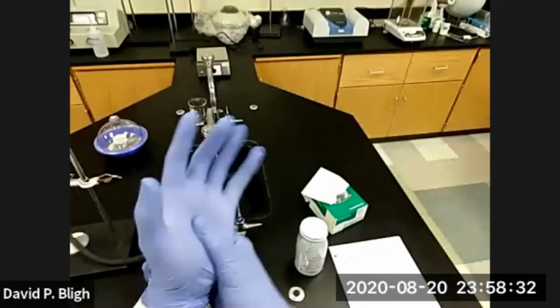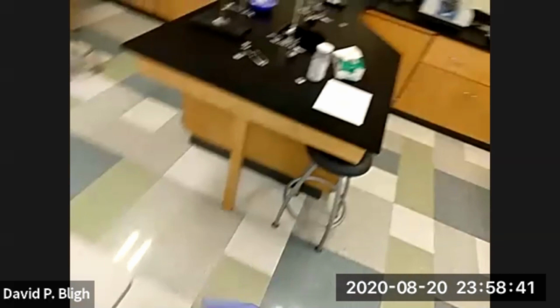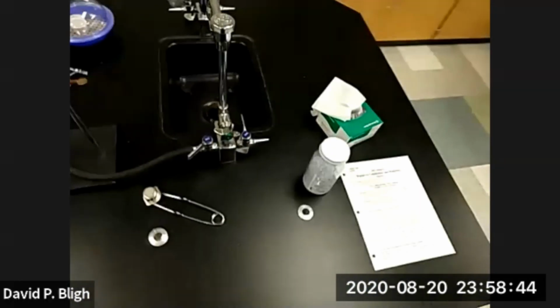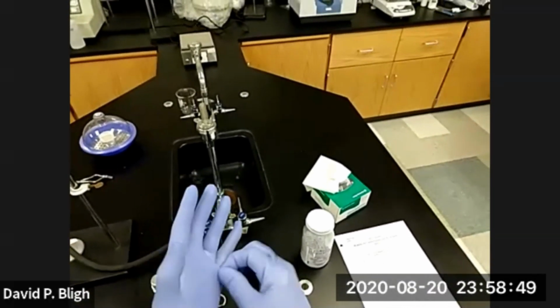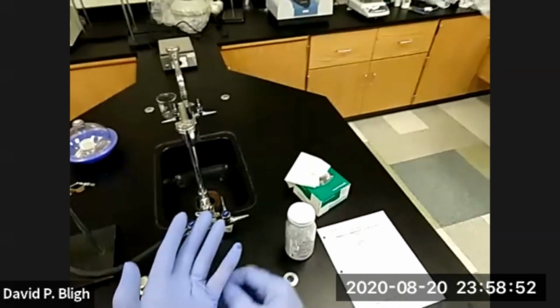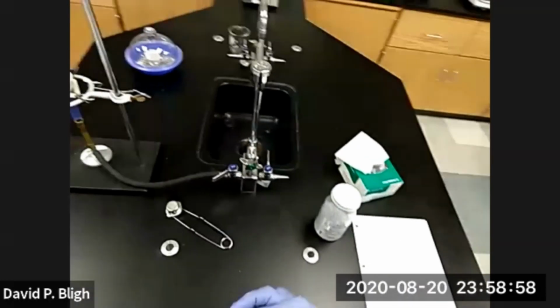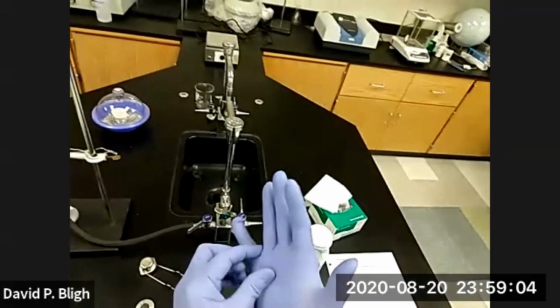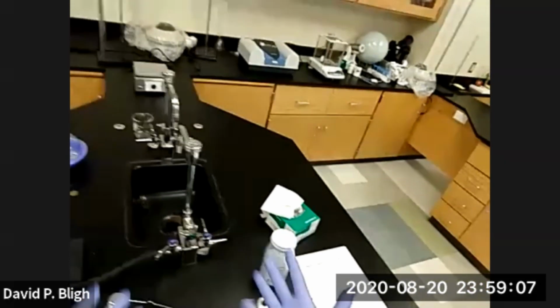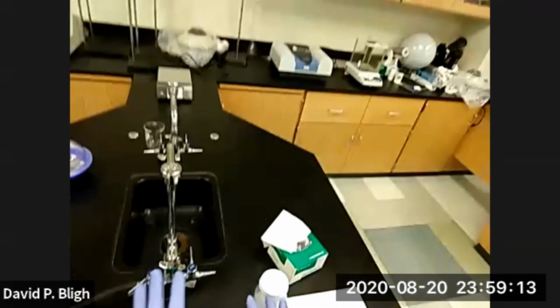We're not using gloves for this experiment. But gloves are a good thing. All right, they protect your hand. They add another layer of protection should you be dealing with anything that's hazardous or even hot, because these gloves will withstand a little bit of temperature before they melt. It gives you some protection. But if your gloves are contaminated rather than your skin, what do you do when you're finished with them? How do you get these gloves off your hands without contaminating yourself in the process?